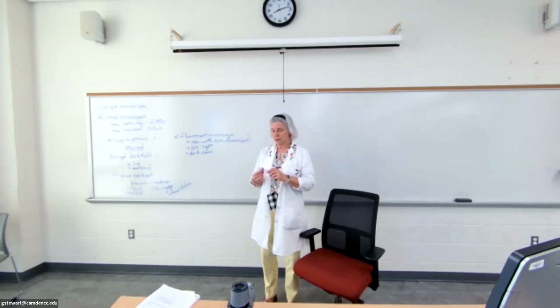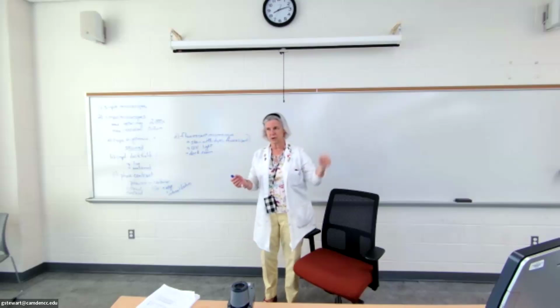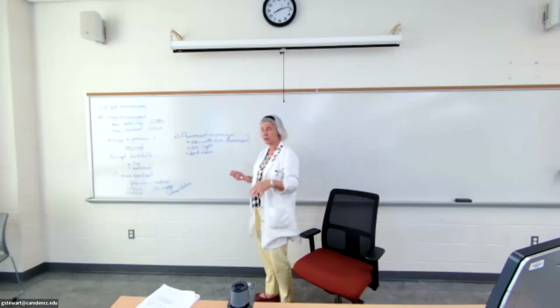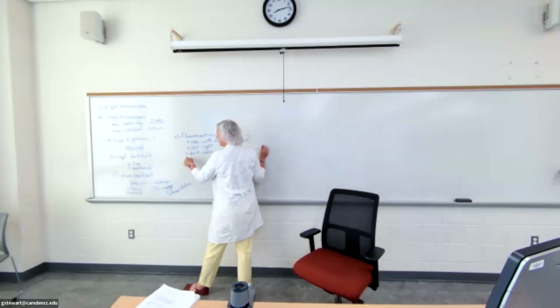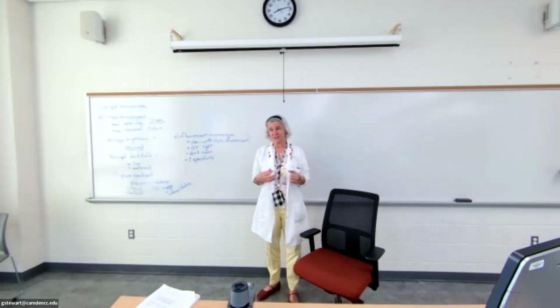Sometimes people don't have the capacity for a dark room, so they have like a blackout curtain that comes around the microscope, so that just the operator and the microscope can fit in there, like in a regular lab. Advantage with this is you can get better specificity. You're not staining everything, you're only staining the thing that you want to see if it's there. And if it's not there, you won't see any of the colors. It'll just be a dark background.